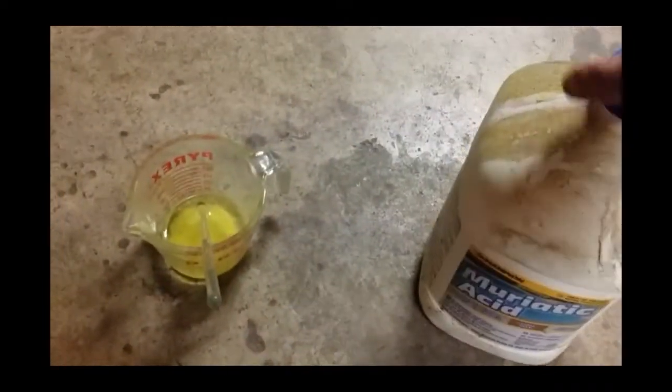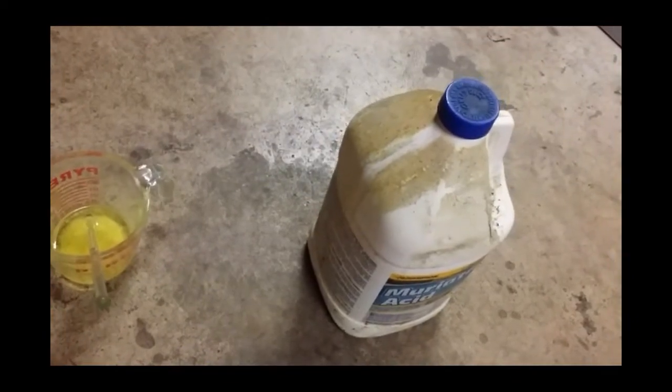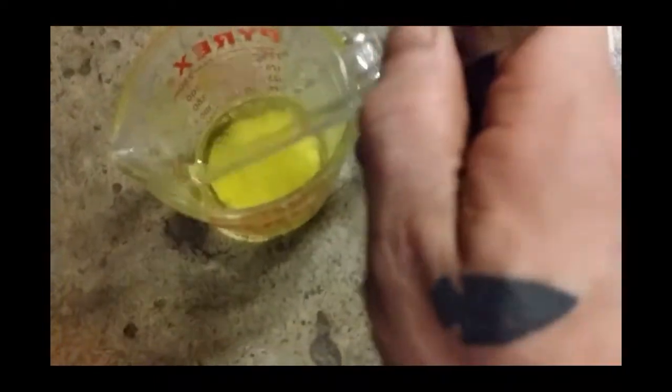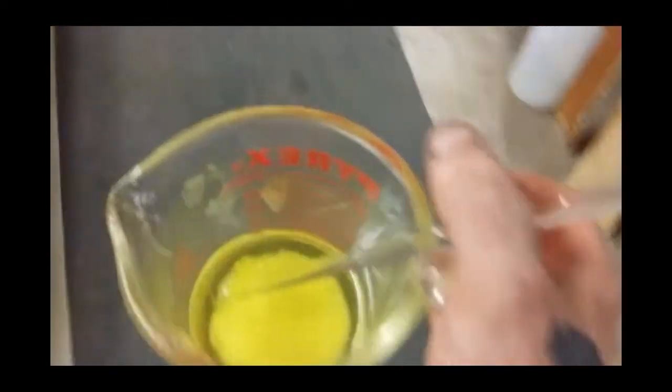I already started doing this and forgot to record it. What I'm doing here is using some hydrochloric acid. It says muriatic, I know. I get it. The jug looks pretty dirty, and I see it's dripping a drop there. It'll neutralize itself on the concrete, but these containers are notorious for that. What I'm doing is I'm washing off all these insolubles. I've used water enough to this point that I know that this stuff is water soluble. So I'm using 32%. It's either 32 or 34.5% hydrochloric acid.